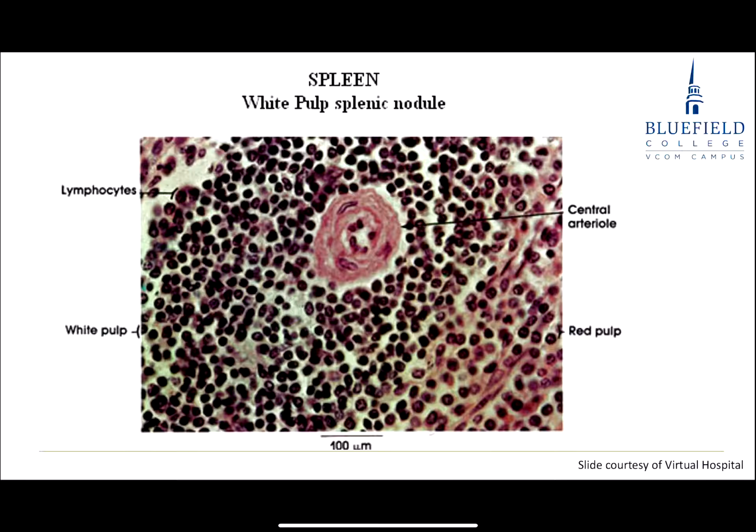Okay? And once again, if we were doing this with a microscope, I'd have you, when you look at spleen, go to higher power on that white pulp and find that central artery inside of it.